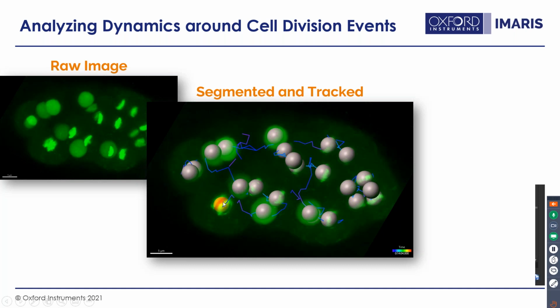We can see that there are cell divisions. Those get automatically detected using our lineage algorithm for tracking. They are automatically labeled as an event when you use the lineage tracking, and they can automatically be labeled with a color for you. In this case, that's red.